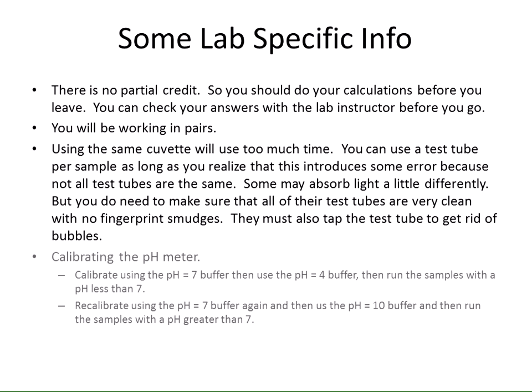You will have to calibrate your pH meter at the low range of the pH, and again when you need to do a higher measurement for the pH. So when you're calibrating at the lower pHs, use a buffer of pH 7 and a buffer of pH 4, and then recalibrate the meter with 7 and 10 buffers when you need to measure pHs of higher than 7.